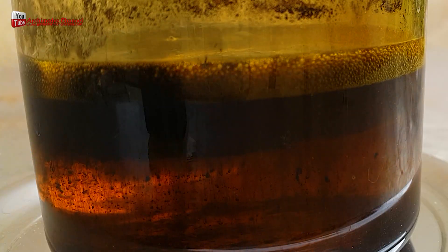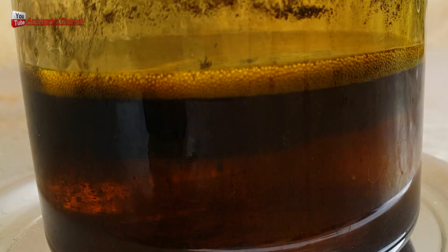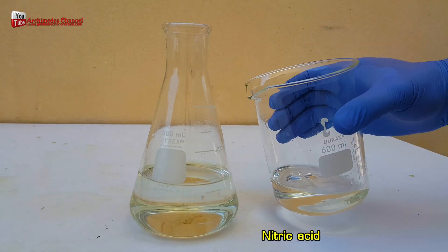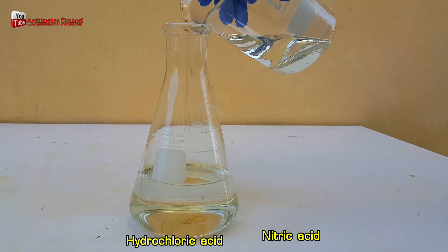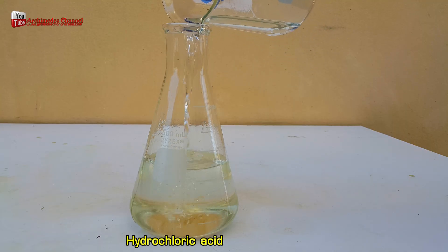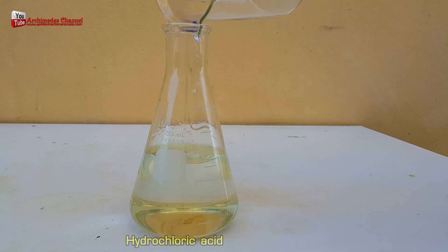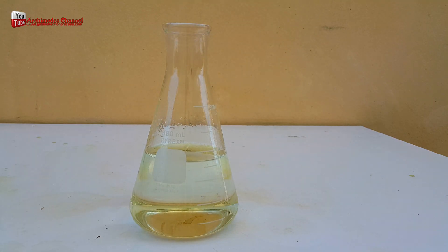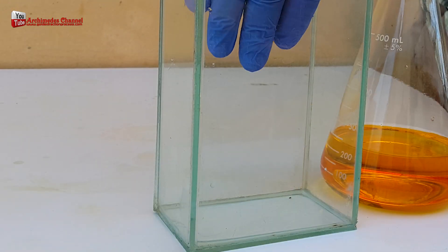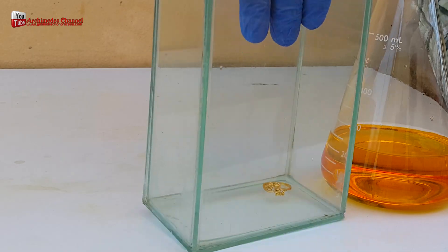Hello friends. Aqua regia is composed of two chemical substances with a ratio of 1 part nitric acid to 3 parts hydrochloric acid mixed together. The ratio between gold alloy and acid aqua regia is 50 grams of gold alloy to 200 millilitres of aqua regia. From my experiment, gold alloy was dissolved into solution at a temperature of 90 degrees Celsius to reach saturation point.